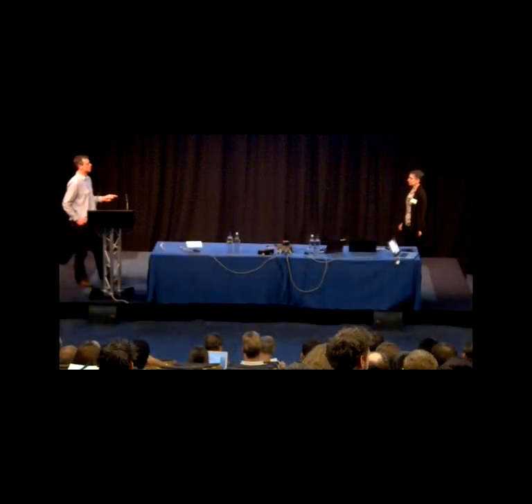Okay, I have a quick question about your kinase X. You tried single search models in your brute force approach. You didn't try an ensemble approach in Phaser. Yes, they did try an ensemble. And did that work as well? No.